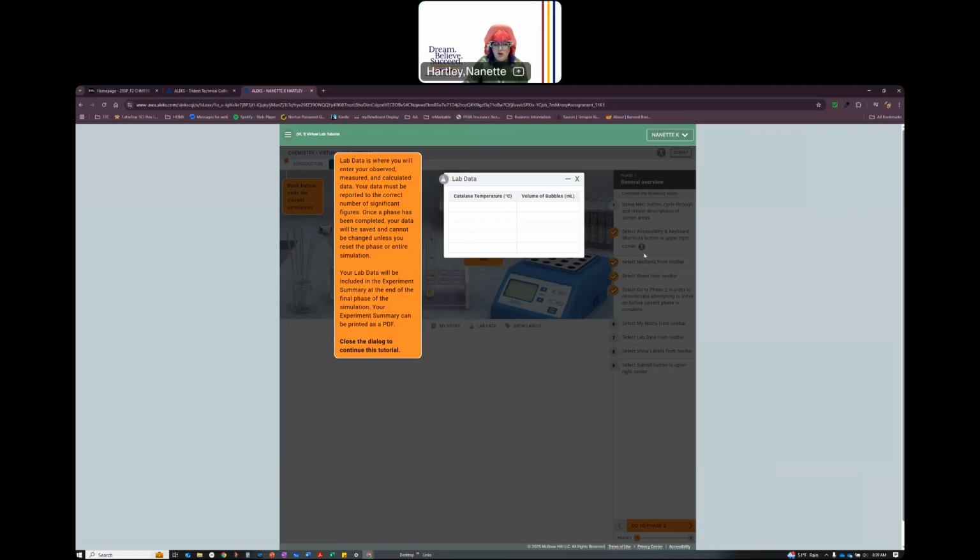So this is where you record all of that stuff about lab data. Those are different observations than the notes that you would be taking to say, I don't understand what's going on. This is observations that you've made, data that you collected, and all of it has to be done at the time that you took it. So if you go over to an instrument, you need to write it down when you go over there. So that lab notebook needs to have anything that you observed. And if it's not what you expect, you need to write down, this isn't what I thought would happen. Now, it may be that that's what's supposed to happen, but it's not what you thought would happen. Okay, so you should be recording that.